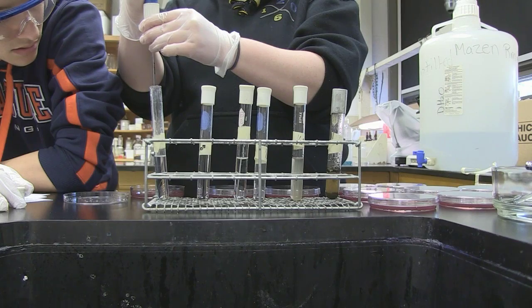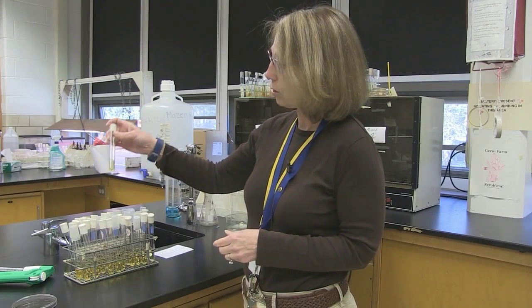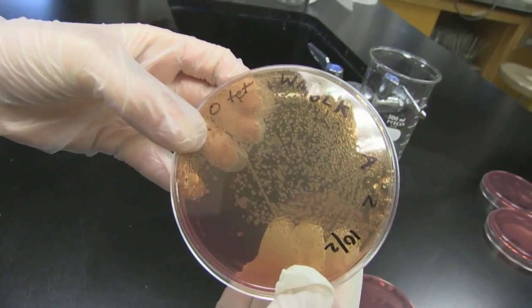We take that into the microbiology lab, take a sample of the soil and dilute it into a broth. Soil contains natural bacteria all the time, and not all of that bacteria is bad. Instead of using any general media, which lots of bacteria and fungi would grow on, we used a selective and differential media that would only allow us to grow gram-negative bacteria, which is a certain group of bacteria.